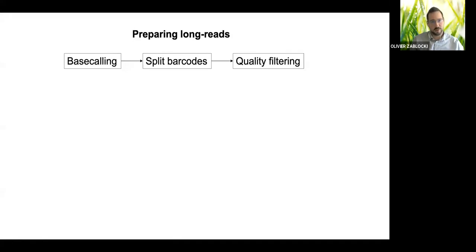As the electric signal is passed through the software, you can have the DNA sequence base called very quickly. Here, this will really be for high scale and specific to our study. So we'll really see the manual version of this, but the automated way also occurs.